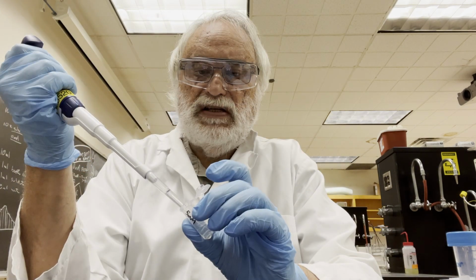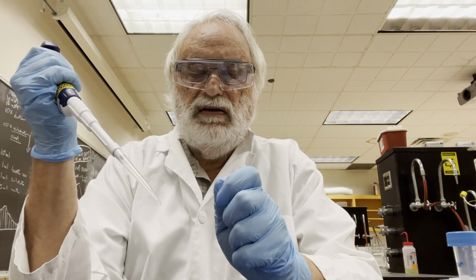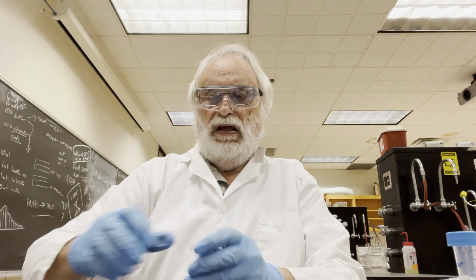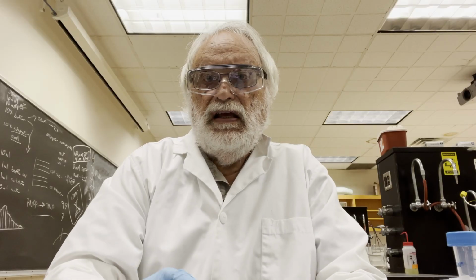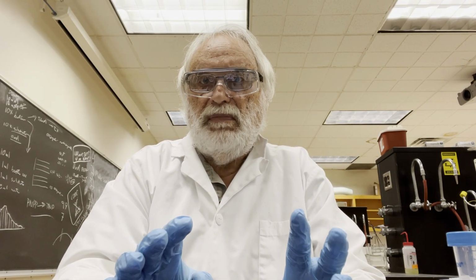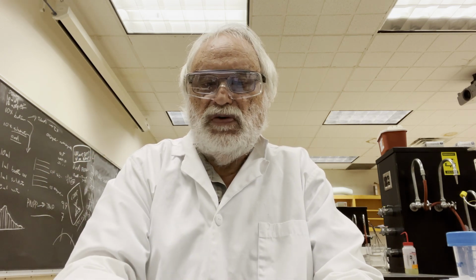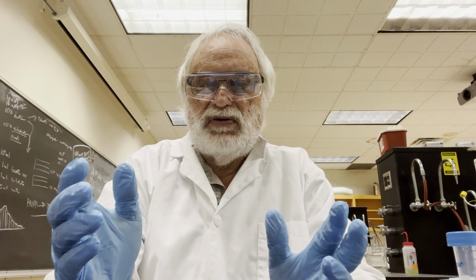I've done this a couple of times this semester, so I'll just do this quickly. Go through here and get to the end. Okay, what I've done is the serial dilution twice. The reason I did this twice is we're going to need about 1.5 milliliters, and we don't have any tubes that hold about 3 to 4 milliliters, so I decided to have you guys do it twice: 1, to practice, and 2, just for practical reasons.